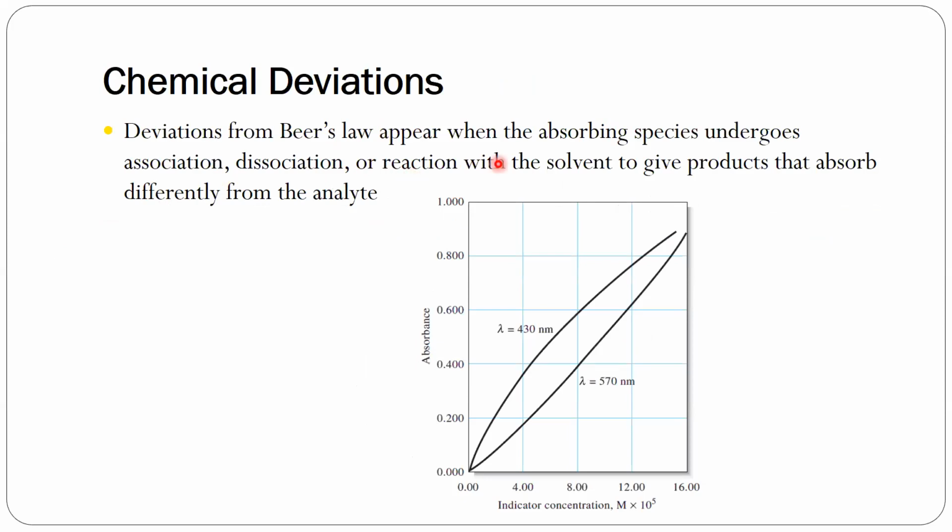Okay? Kasi nga, syempre, let's say for example, yung species sa loob ng sample mo ay nagkaroon ng reaction, they react with each other, they interact with each other, they might give complexes or products that have a different absorbance than that from the analyte.